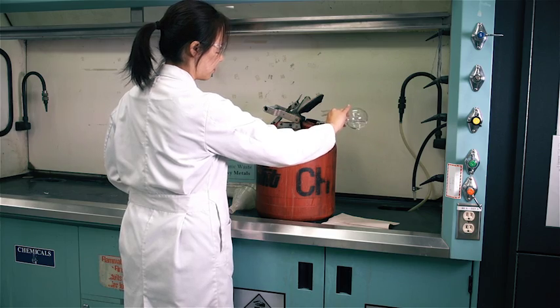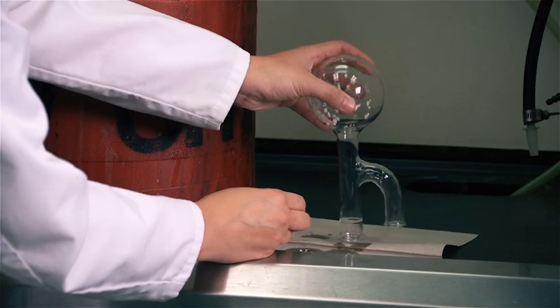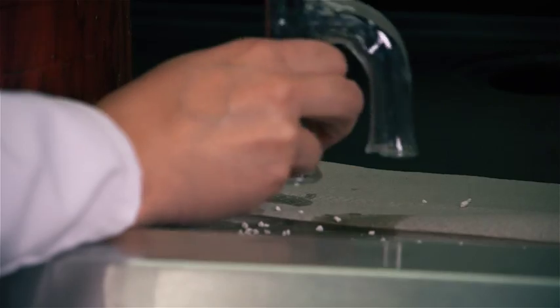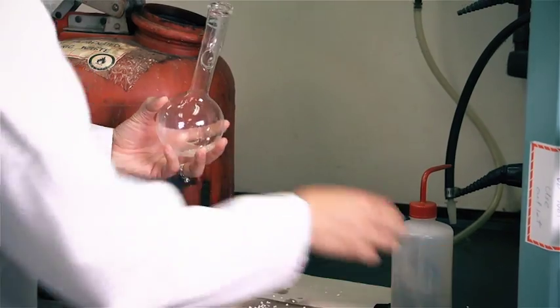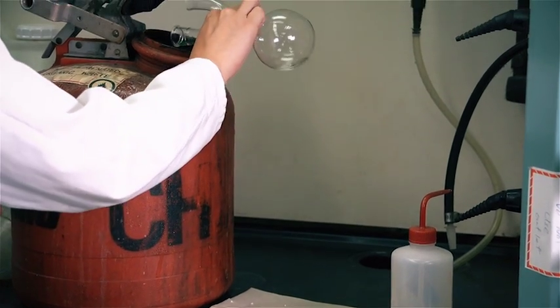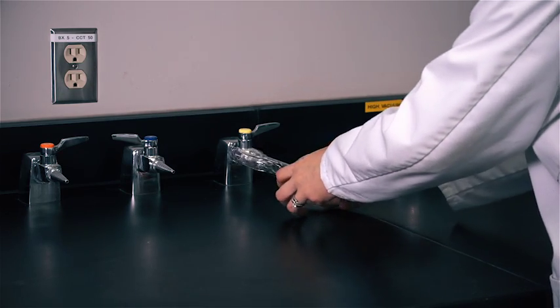Pour the sample into the appropriate waste container. Put the boiling chips into a paper towel and throw into the garbage. Clean the flask using acetone squirt bottle. Use the vacuum to dry the flask. Remember to turn off the condenser water at the end of the experiment.